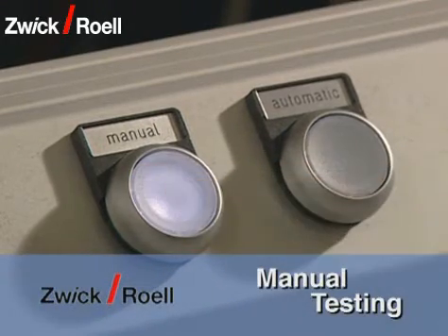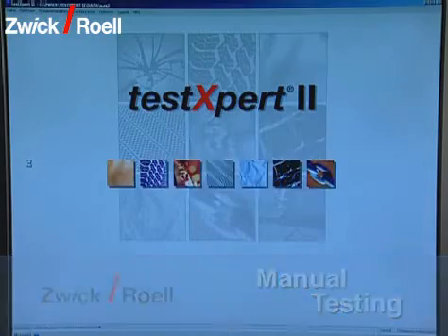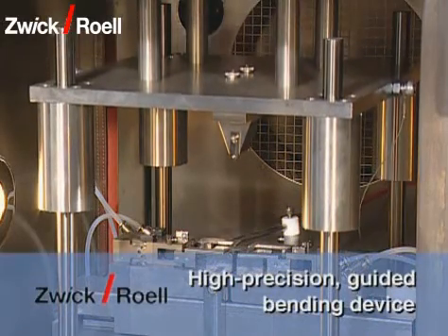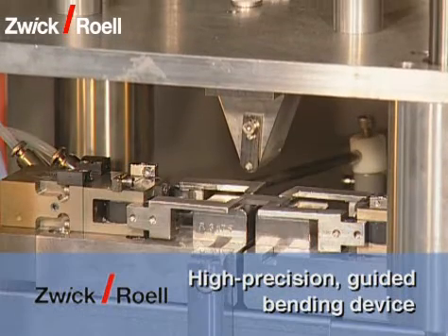With the test system, manual testing is possible at any time. There is no need for retraining as, for both manual as well as for automatic operation, the test expert software is used.